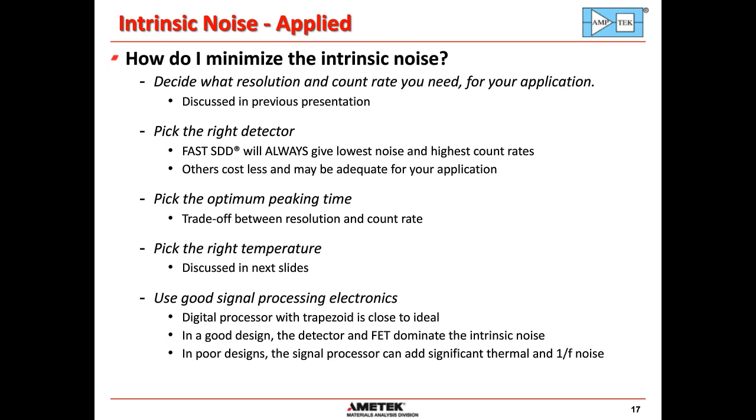Again, the fast SDD will always give you the lowest noise and the highest count rates, but the others cost less, and in many cases their performance is quite adequate for your application. So you have to decide what's the right detector for your application.